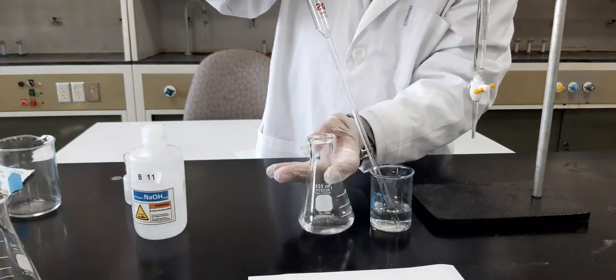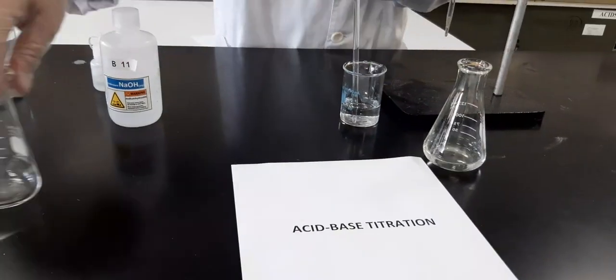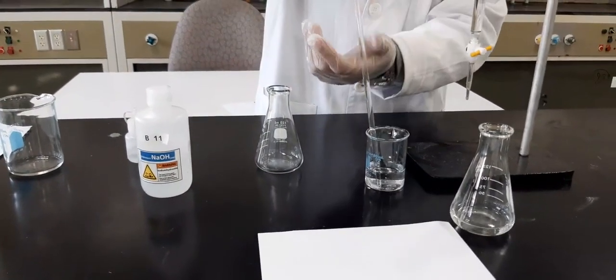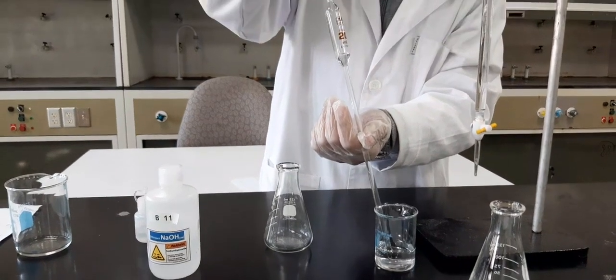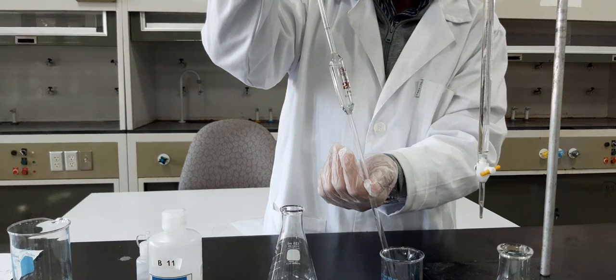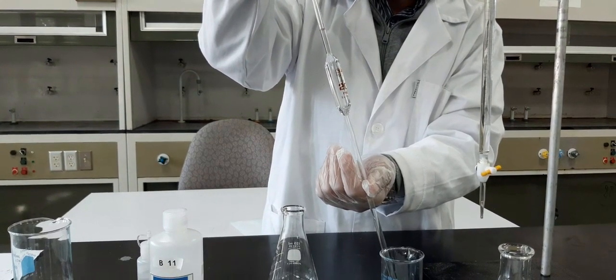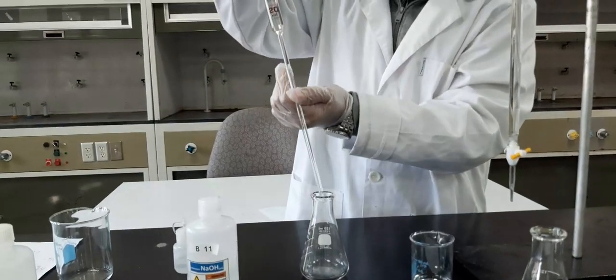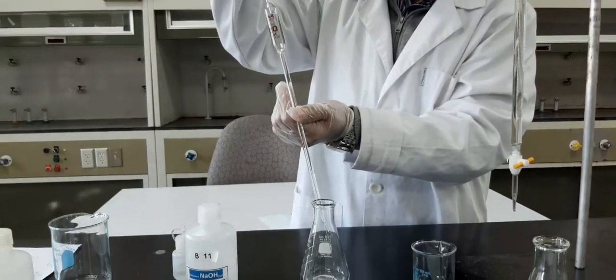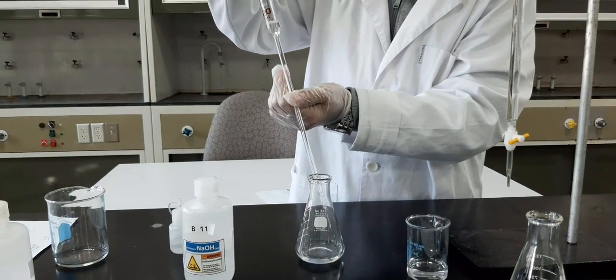You can see this is 20 ml, it's ready. Now I will bring another one here. Let's take 20 ml in another flask. You will be given 3 conical flasks. You have to add 20 ml in each one before starting. So this is 20 ml to the mark. Transfer it slowly. When it has been transferred completely, then we will proceed further.